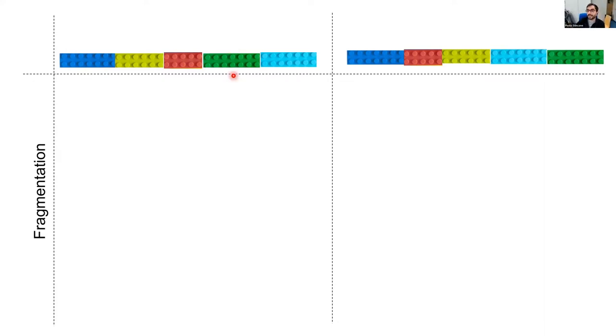Trypsin breaks the protein in a specific site, I believe, no? No, we're not at that already, fine. Okay. No, we are in the mass spec, and we're looking at peptides. And indeed, you could think of peptides that were derived from a tryptic digestion. But now, the analogy I want to make is that these bricks can be amino acids. So either think of sequences of Lego bricks, or think of sequences of amino acids in a peptide.